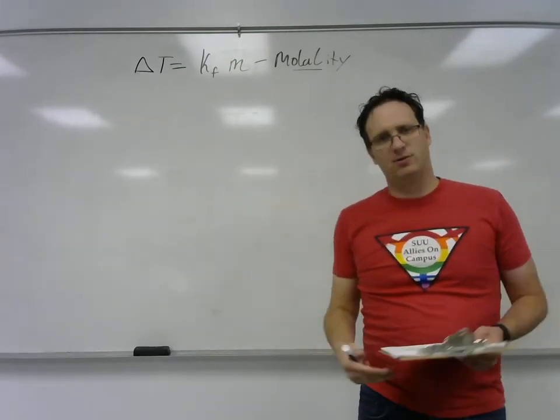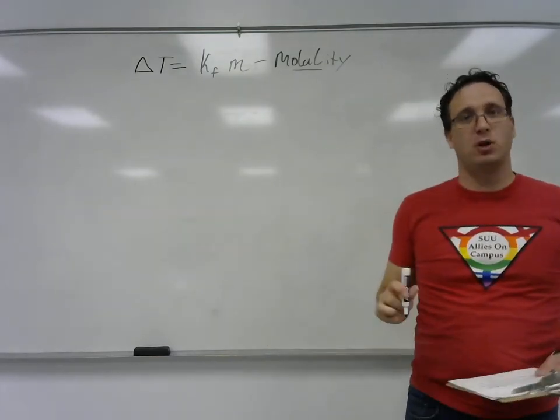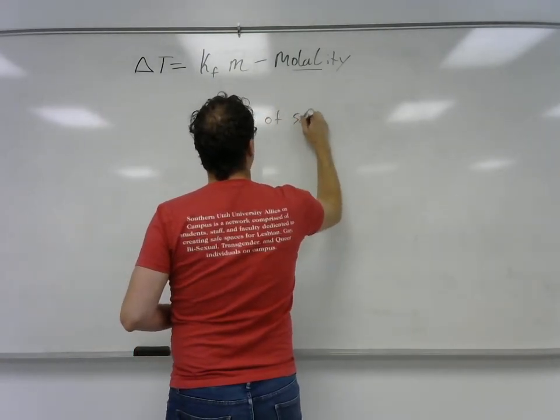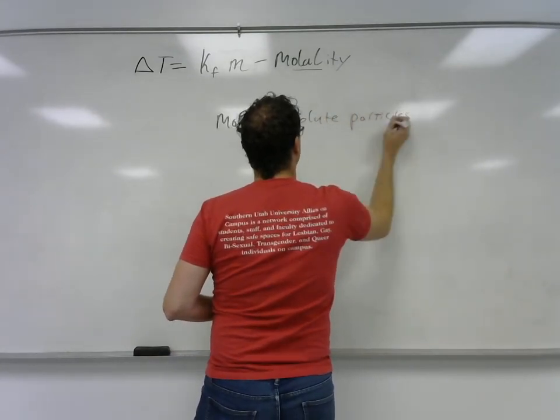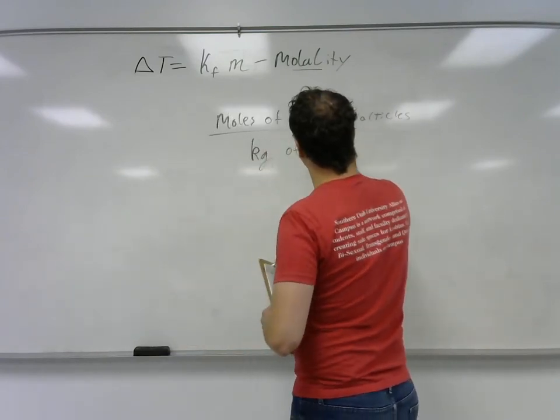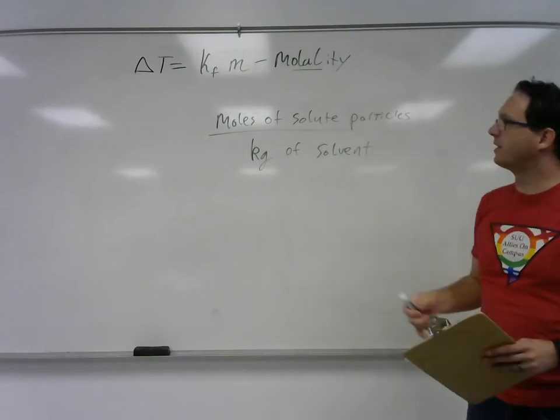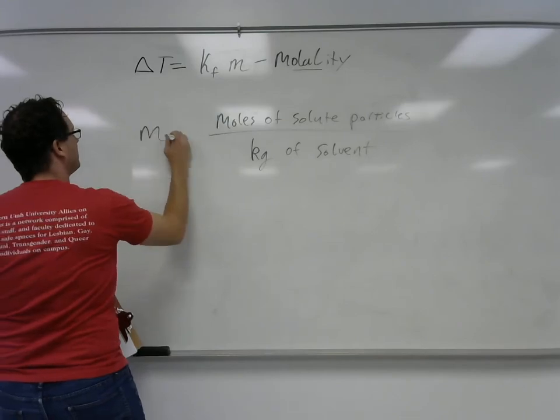And this is maybe the only really tricky part about this lab. Molality is a little bit different than molarity. And so what we have is the moles of solute particles over kilograms of solvent. Not the total kilograms of solution, but the kilograms only of the solvent. And this is what is the molality.